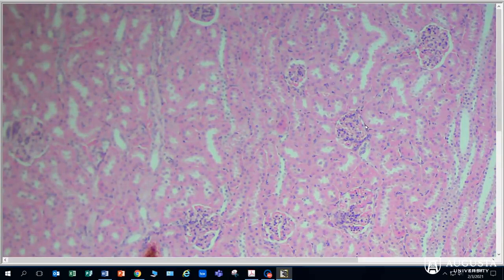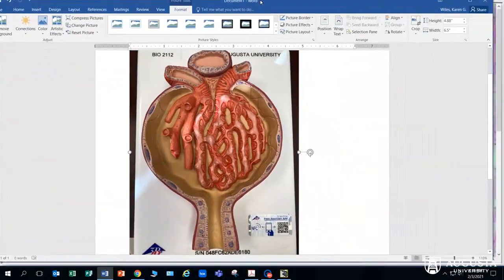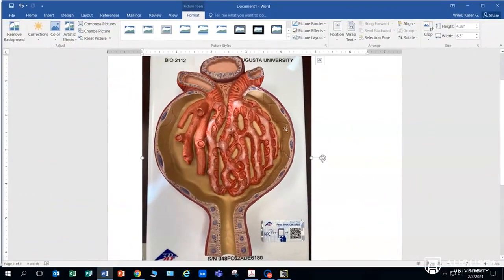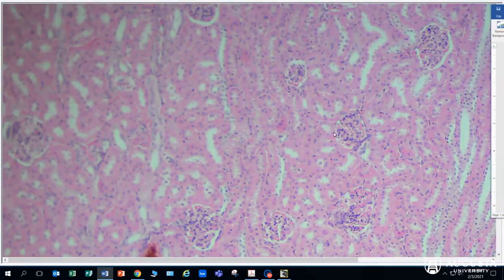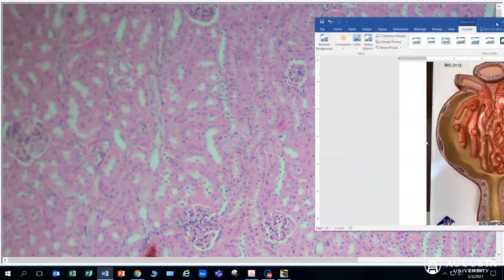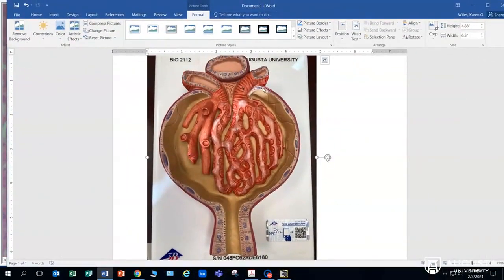This structure is the glomerulus, and what we're looking at is this model. Here's that darkly staining structure, which we can see right here. We have a bundle of cells surrounded by a structure called Bowman's capsule, and Bowman's capsule is made up of simple squamous epithelial tissue.